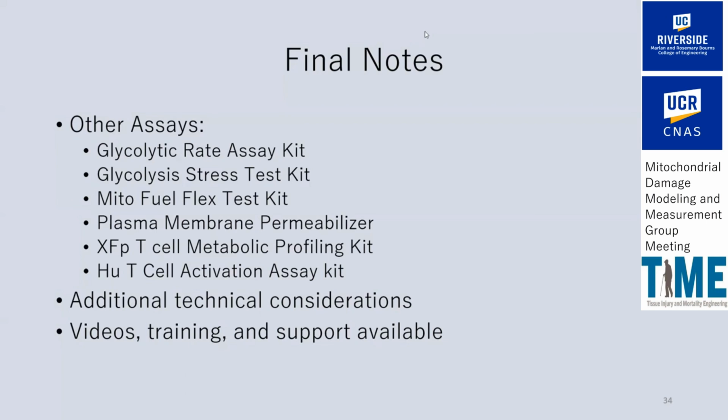And so part of the process is optimizing the number of cells that you use. However, I know that your lab uses HeLa cells, and HeLa cells, I believe, are well documented. So you might be able to even skip that step and get a usable result right away. Thank you.